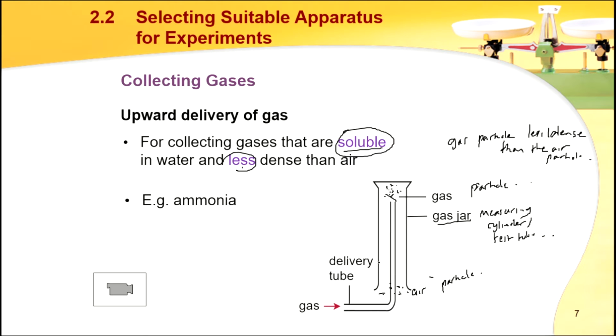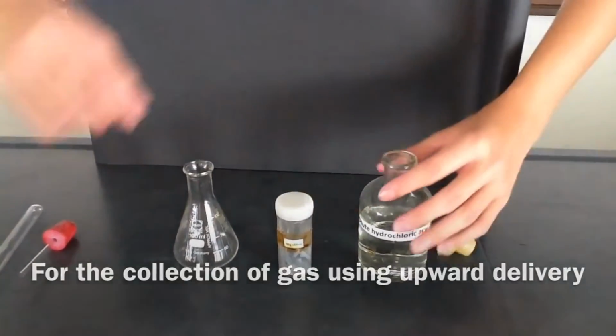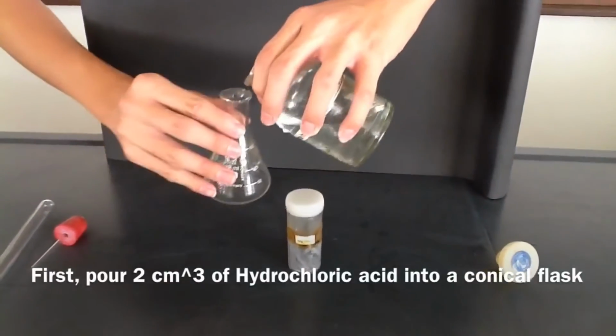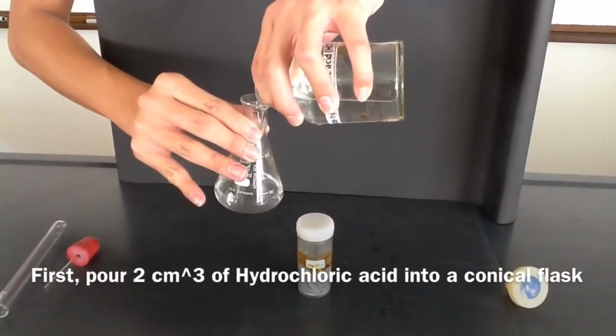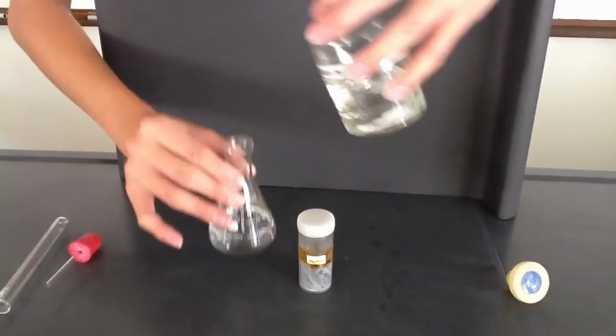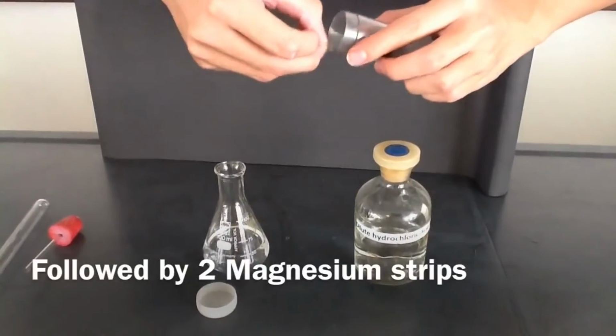Let's watch the video about the upward delivery of gas. For the collection of gas using upward delivery, first pour 2 cm³ of hydrochloric acid into the conical flask, followed by 2 magnesium strips.